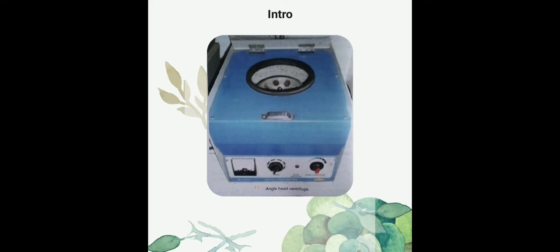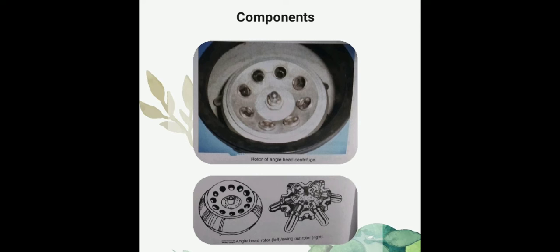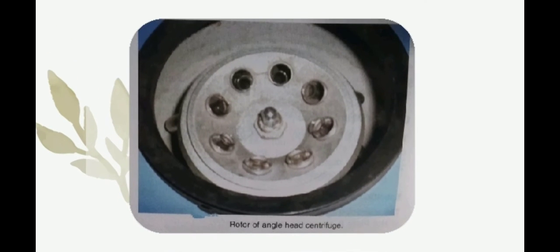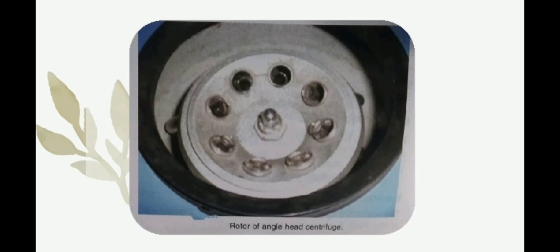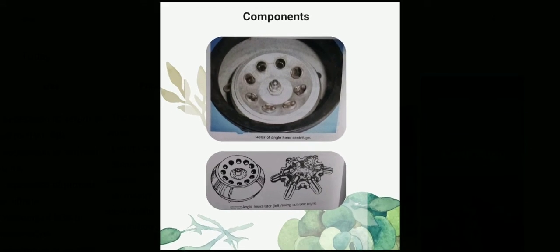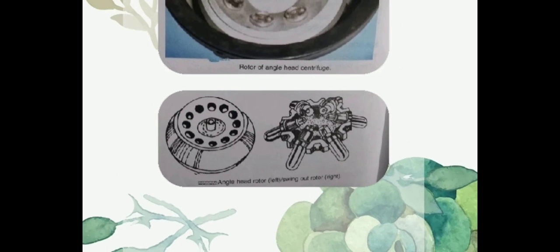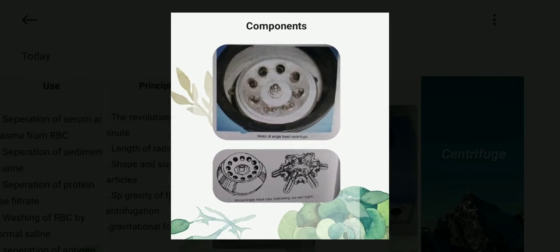The important components of a centrifuge. Number 1. Centrifuge head or rotor with tubes or cups, with cushions at the bottom inside the cups or tubes. Number 2. Motor drive assembly. Number 3. Chamber which encloses the internal parts. Number 4. Power button. Number 5. Speed controller.